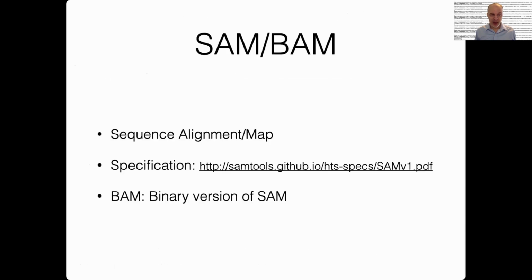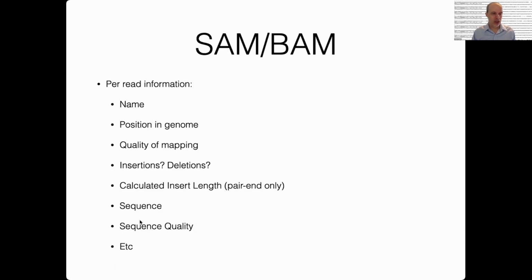But in addition to that, you'll see here sequence, quality scores, and I think name is header. In the SAM file, they call it a name. But it is carrying mapping information. So it carries the information on the position in the genome where it found a match.